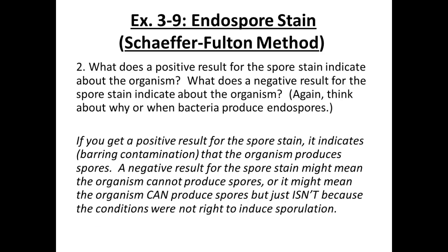Usually nutrient depletion is very good, and very rarely does this not work. We should see spores, but a negative result isn't a definitive negative. Just like pregnancy tests, just because it comes out negative doesn't absolutely mean you're not pregnant. There are limitations in this test. Did you really grow them under harsh conditions to make them form spores? If you don't do that, then you're not going to see spores.